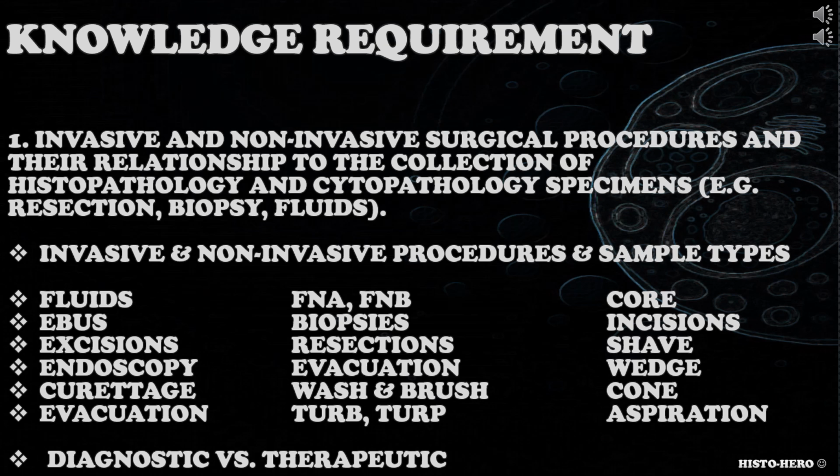Which procedures are considered invasive and which are not? Also consider types of samples these produce, like cores, punch biopsies, fluids, washes, brushes, and so on. When would each procedure be used? Is there a difference in how those obtained specimens are processed in the lab? Consider it from this section point of view. Consider diagnostic versus therapeutic reasons.